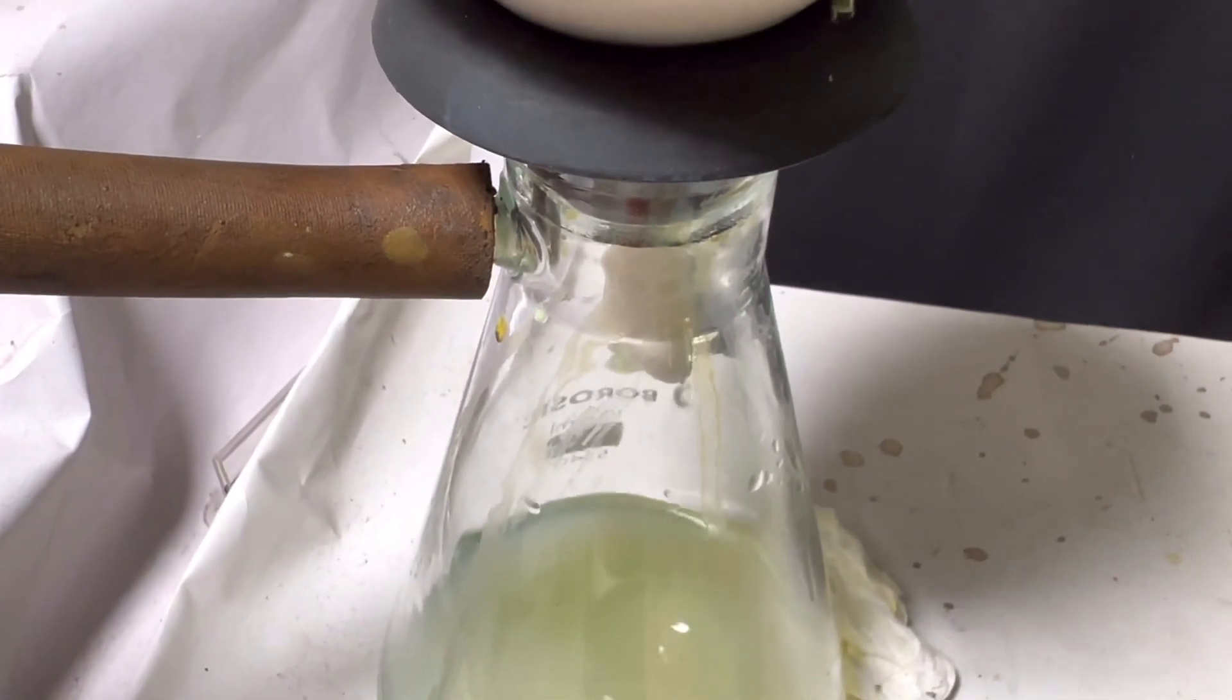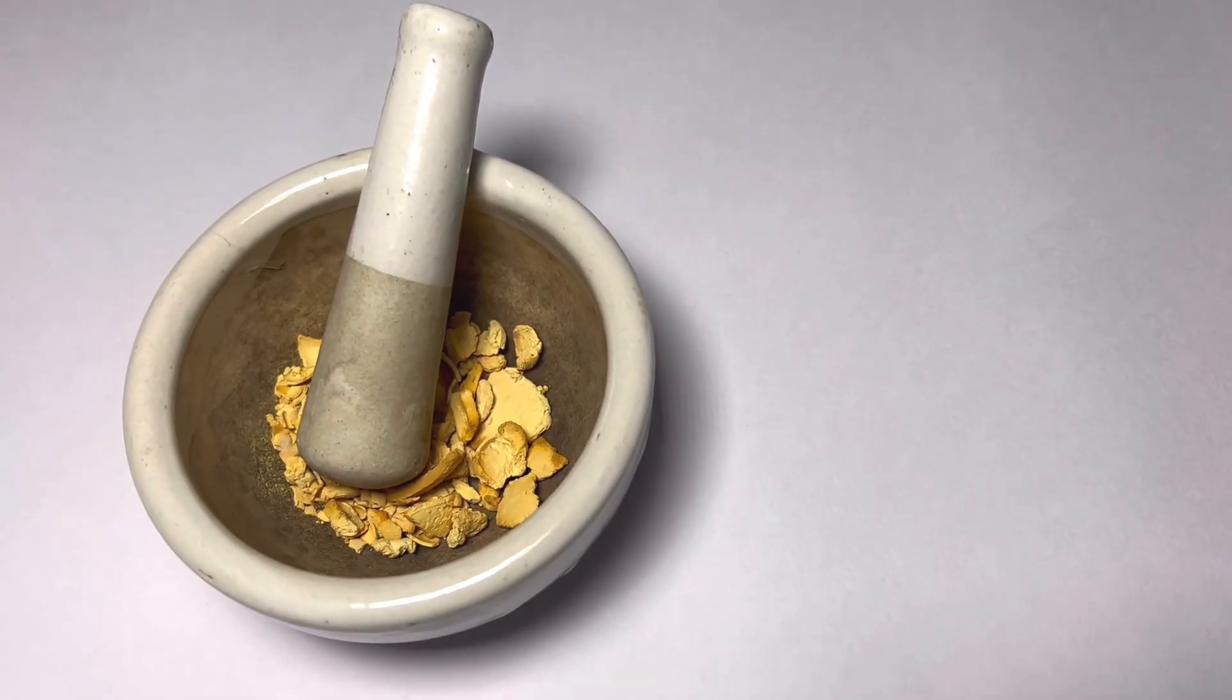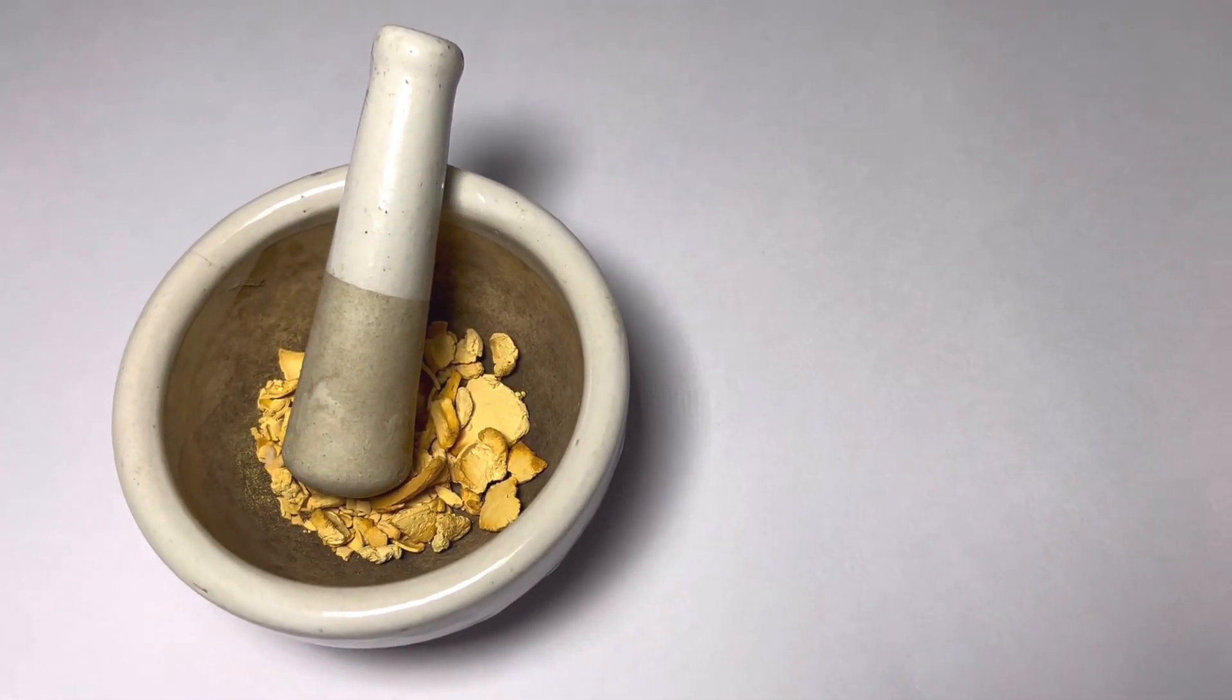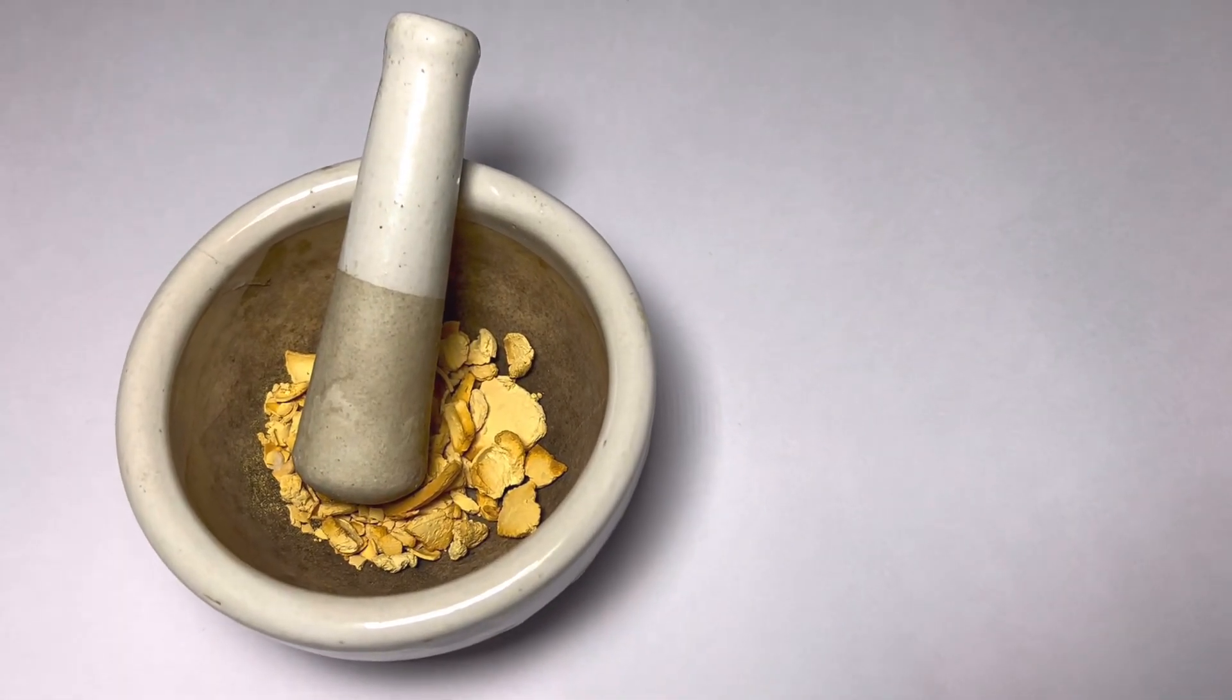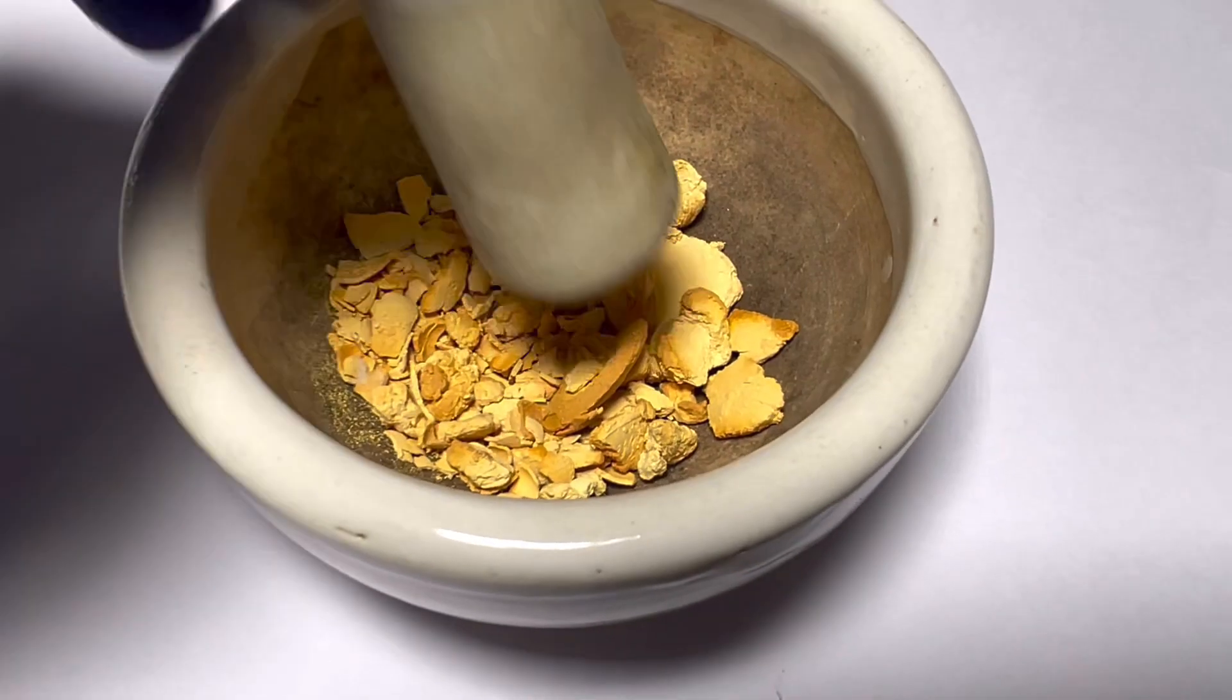Once it is dried in the Buechner funnel, keep the solid in vacuum desiccator for two days alongside anhydrous calcium chloride. Here is the dry product. It was then pulverized to a fine powder.